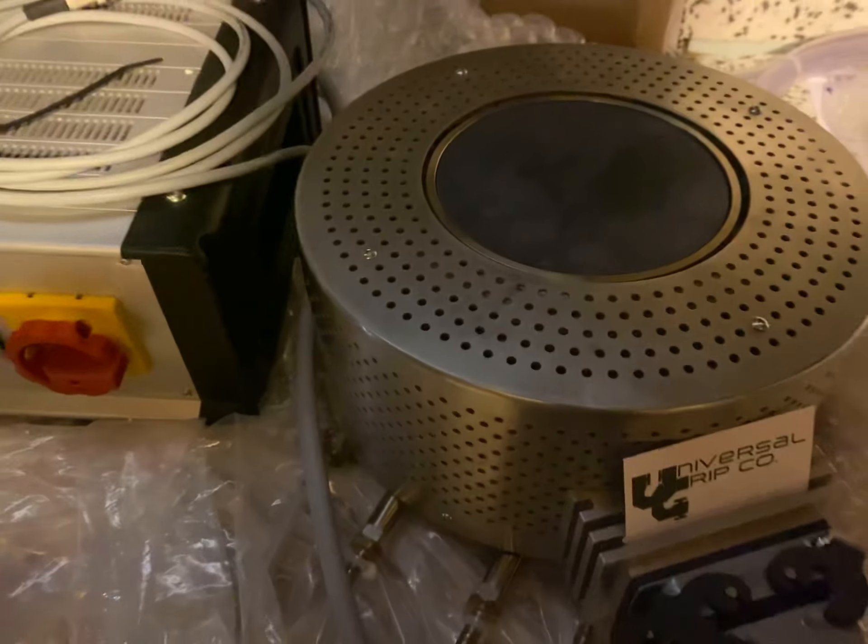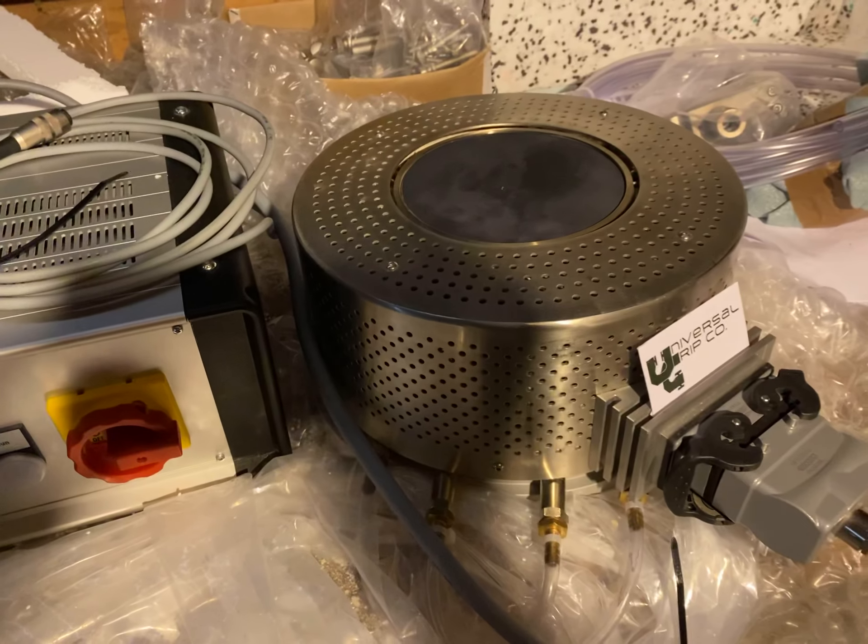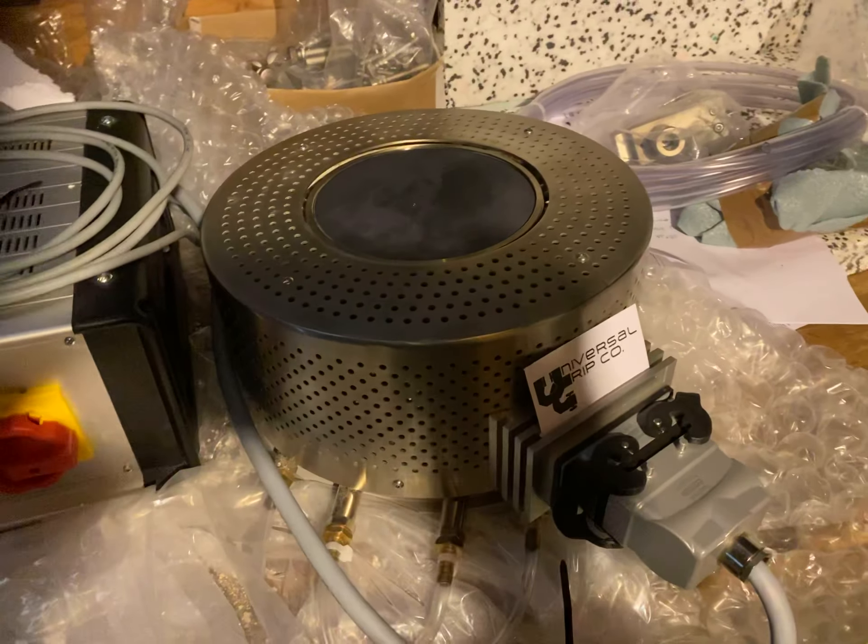You really don't need the circulator unless you're running this 24/7. If you're just doing it for a few hours a day, you can run it straight from the tap.